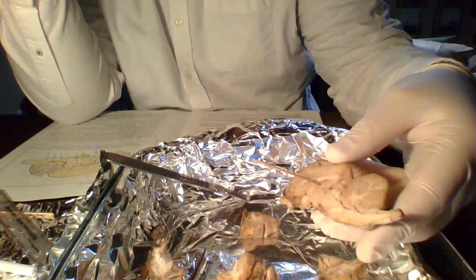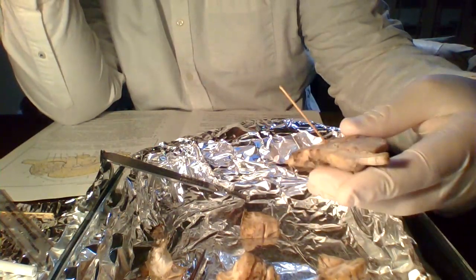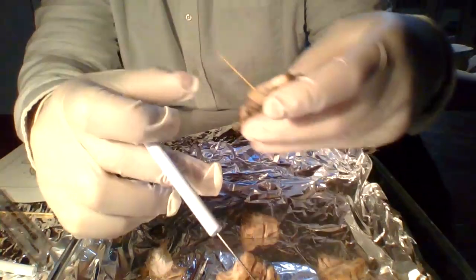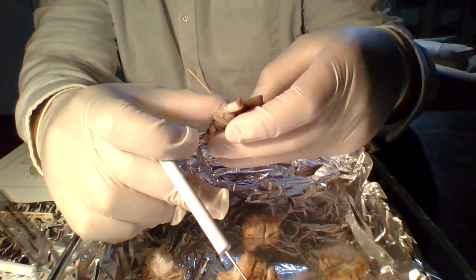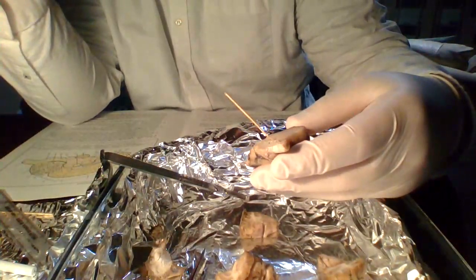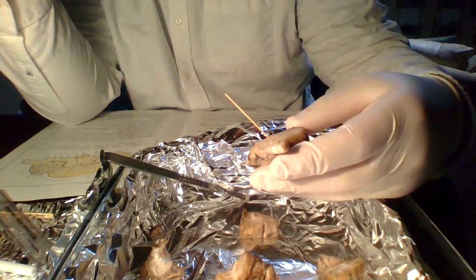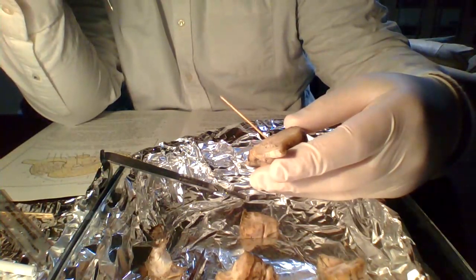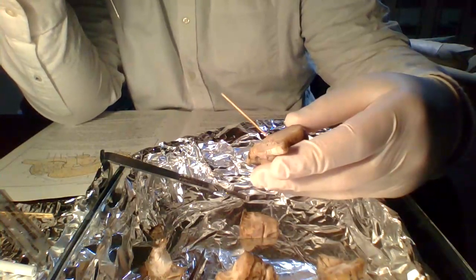It is the corpus callosum up here. Huh. I was associating it to a human structure. Oh, I messed up. Okay. It's a sheep brain, so it must be organized in a different way. Okay, Garrick, let's try to do better.